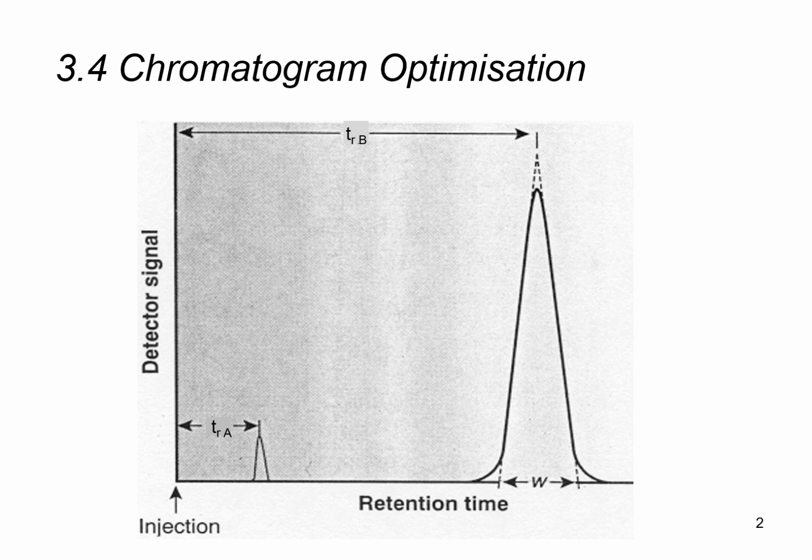So this is an example, we've seen this chromatogram earlier, whereby our two peaks, peak A and peak B, are clearly quite well resolved, so they are quite well separated. So of course, the calculation of resolution for these two peaks will be the difference in retention times. So it will be TR of B minus TR of A as the numerator term, and 2 times of that divided by the sum of the peak widths. So we would take the peak width of A plus the peak width of B, and that would be our denominator term for the calculation of resolution.